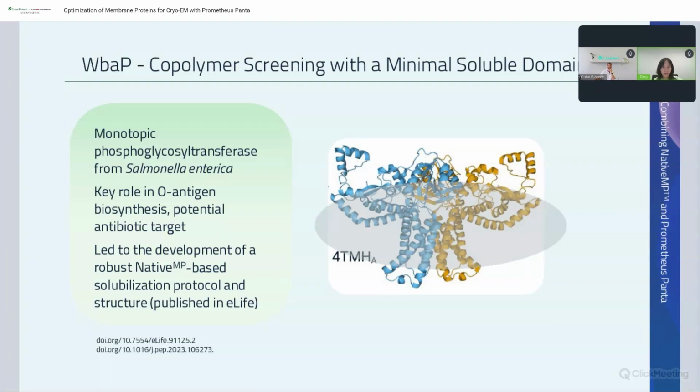That's a very good question, Ping. Primarily, the protein is embedded into the membrane, and as I introduced, it has very minimal soluble domain exposure, which complicates everything from expression over purification, and also, of course, the biophysical analysis. You have this ball which is embedded in the membrane, and you somehow have to get it out of there.